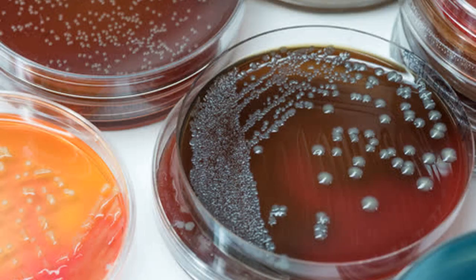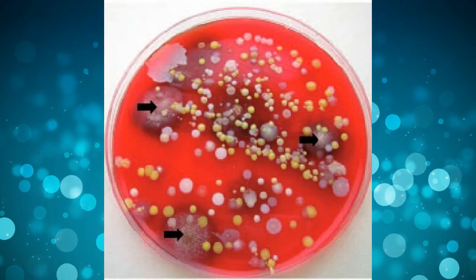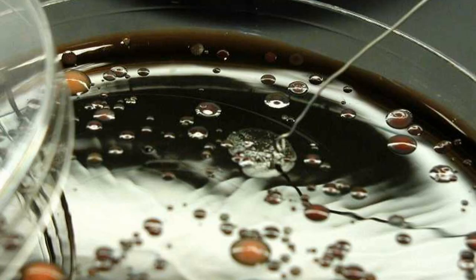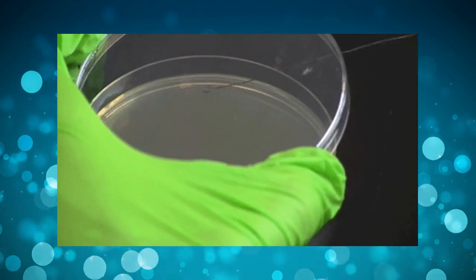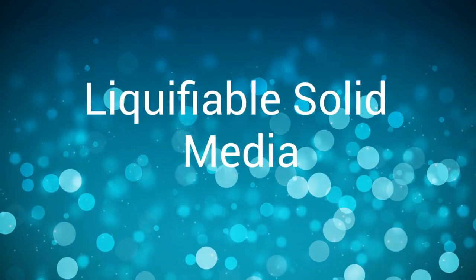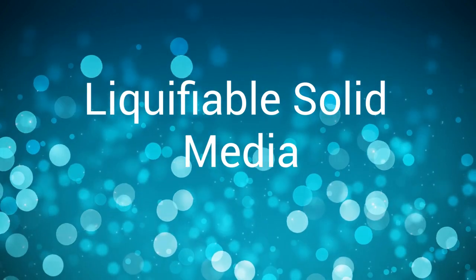Next is the solid medium. Solid media provide a firm solid surface on which bacteria can grow on top and form discrete colonies. They are used to isolate different types of bacteria growing on the solid medium from each other. We pick a single colony and subculture it onto fresh solid medium to obtain a pure culture of the microbe for further identification. Liquifiable solid media are also called reversible solid media.